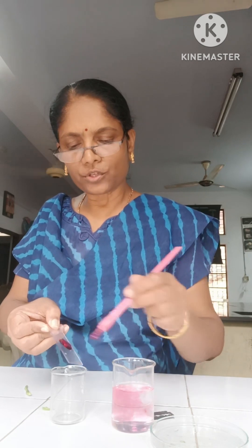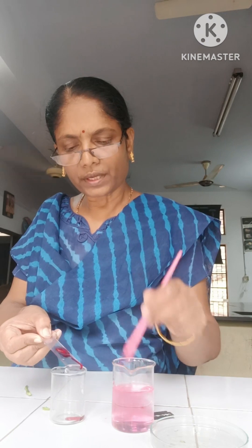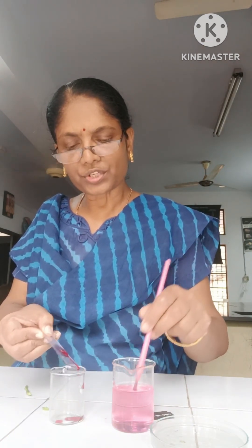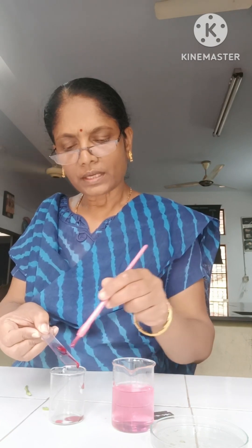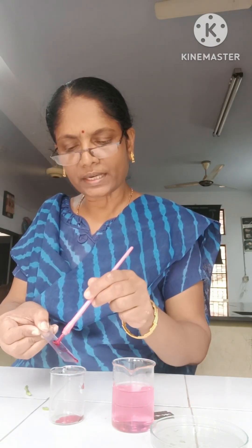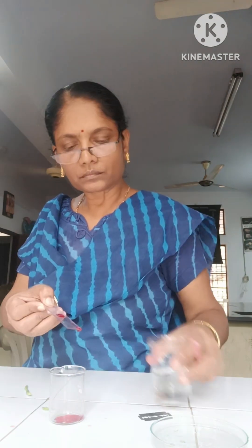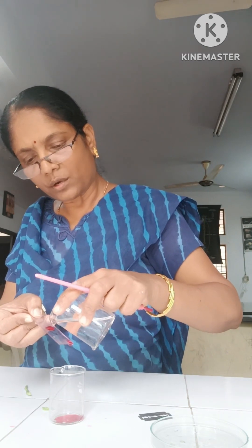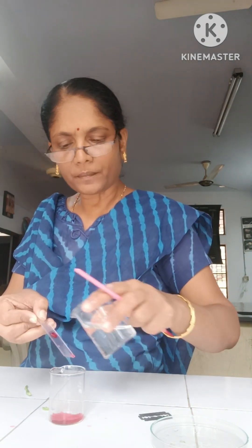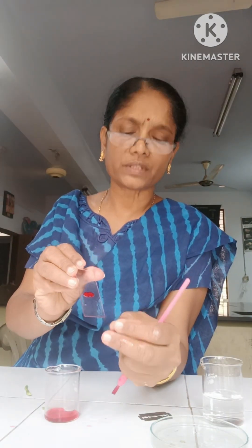Now it is going to be washed in water. So now we can add the water drop by drop and wash it. The stain has to be removed fully. It has to be clean — only then it can be observed clearly under the microscope. Now slowly you can add water. Now it is washed fully. Can you observe, children — it has been washed fully with the help of water.